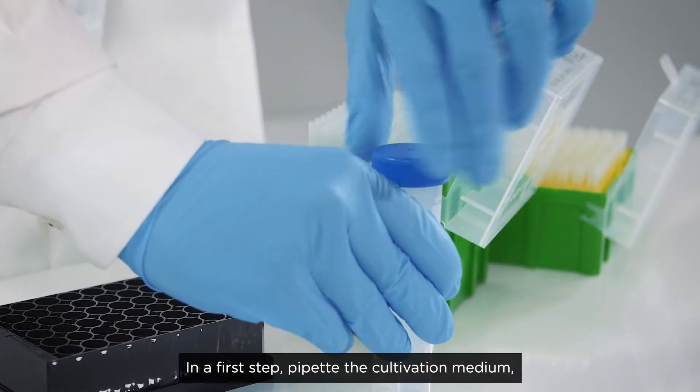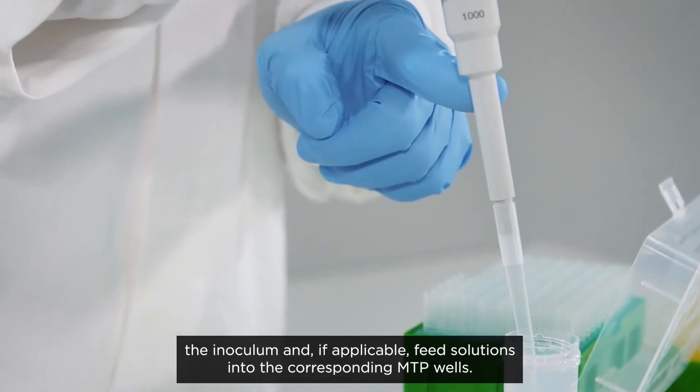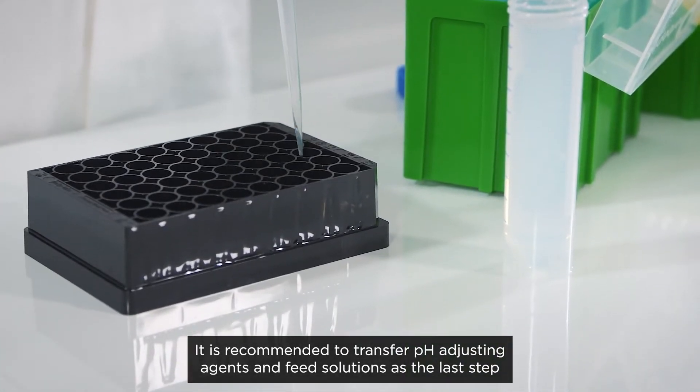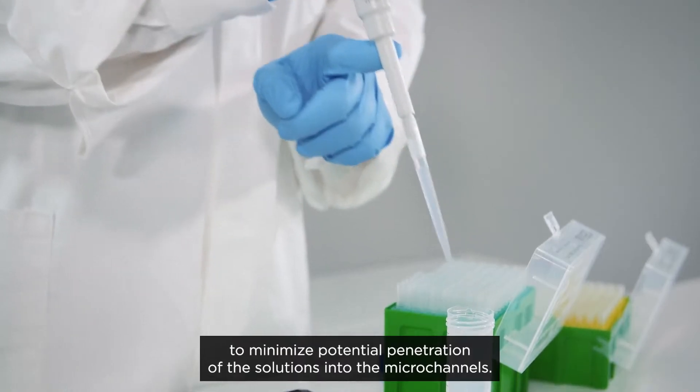In a first step, pipette the cultivation medium, the inoculum, and if applicable, feed solutions into the corresponding MTP wells. It is recommended to transfer pH adjusting agents and feed solutions as the last step to minimize potential penetration of the solutions into the microchannels.